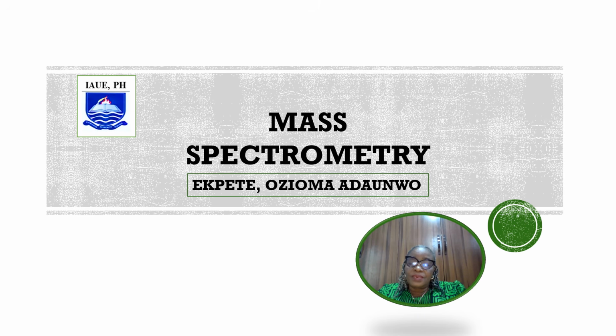Mass spectrometry is a technique that involves the bombardment of molecules of a compound in the gas phase with a beam of high-energy electrons, usually about 70 electron volts. The process, known as electron impact, EI, may knock off an electron from a sample molecule to produce a molecular ion, M+, of high energy.